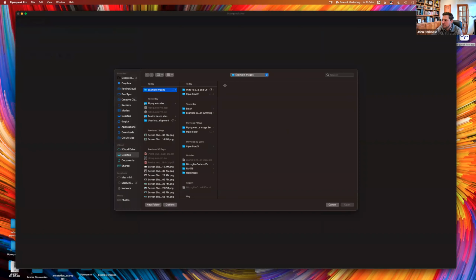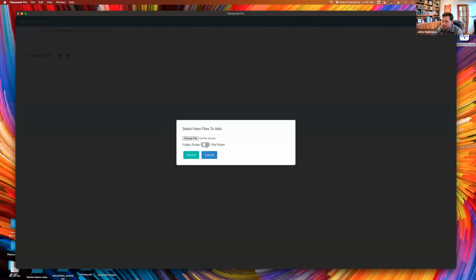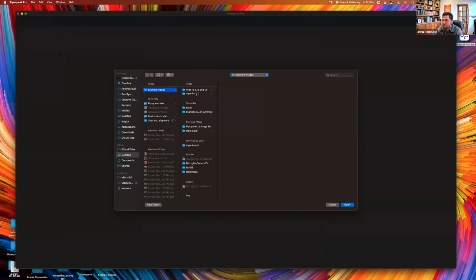This is a really cool thing to show here. I have the ability to either upload just the images themselves, or I'm really excited to announce that I'm able to upload files and folders. And so this is really important for the type of analysis that we were doing in my postdoctoral lab with Dr. Barbara Sorb, because often our folders look like this. Maybe you can relate to it.